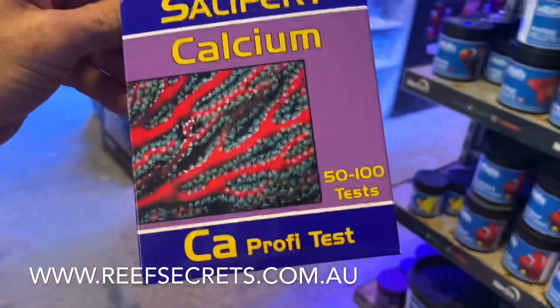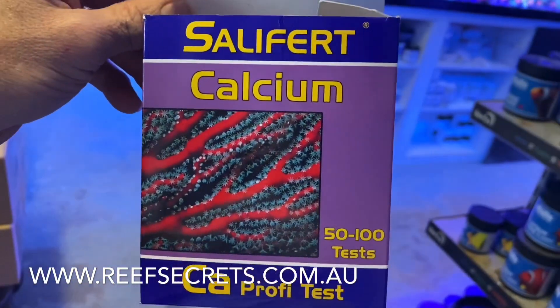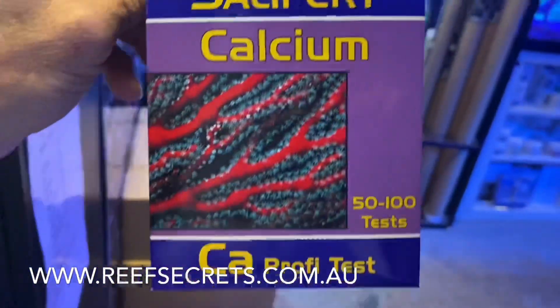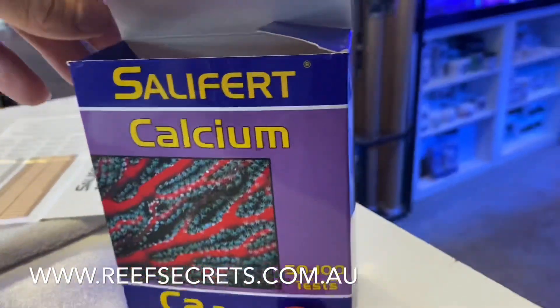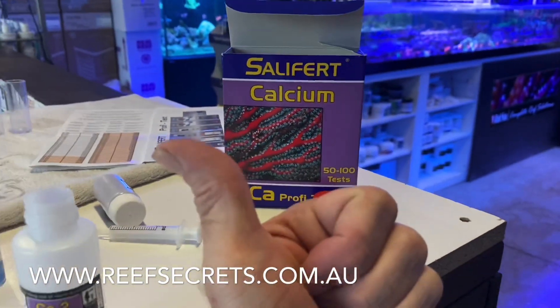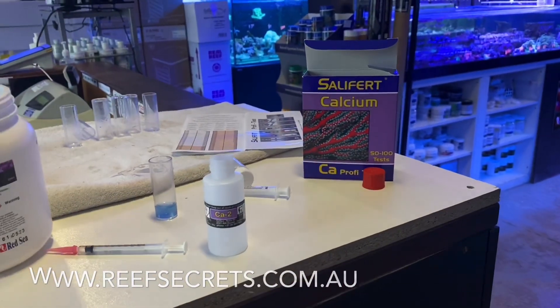That is how easy the new Salifert calcium test kit is — it's now a two-step stage instead of a three-step stage. Initially I was a little bit annoyed, but I have to say it's actually pretty easy once you wrap your head around it. That's how you do the Salifert calcium test kit — Darren from Reef Secret Aquariums.